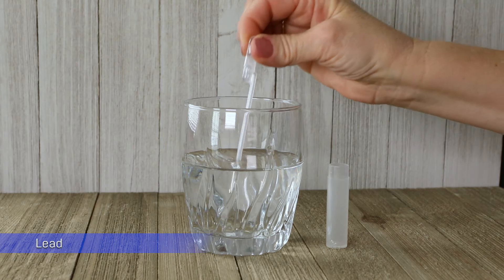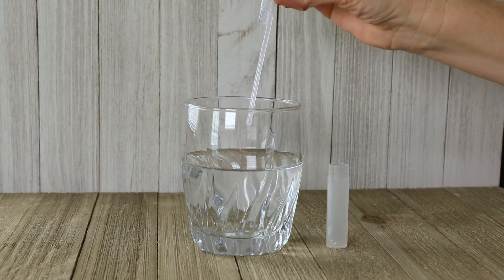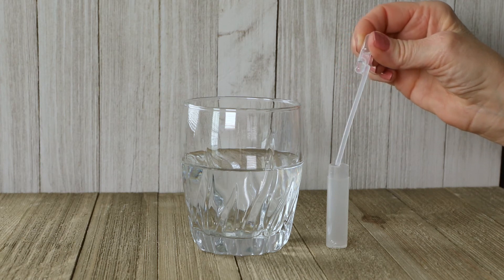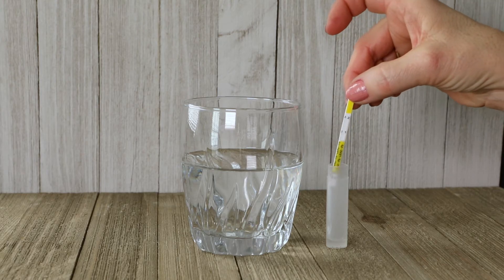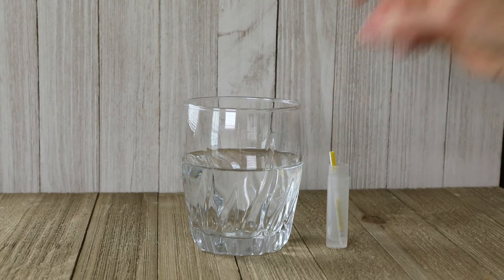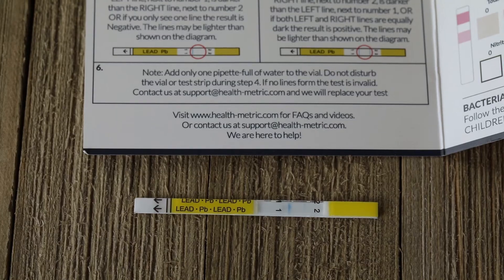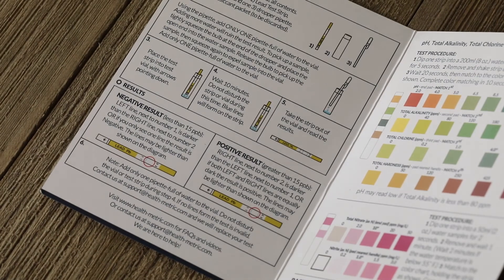Test for lead by taking one water sample with the pipette and adding it to the vial. Follow the detailed instructions in the booklet. Place the strip arrow side down into the vial. Do not disturb the vial or strip for 10 minutes or the test will be invalid. Faint blue lines will form on the strip — compare results to the examples in the booklet.